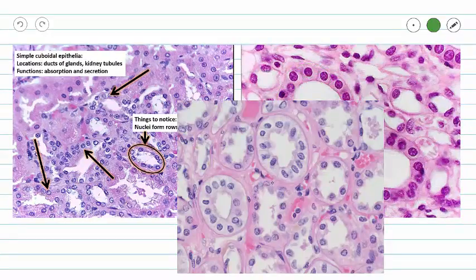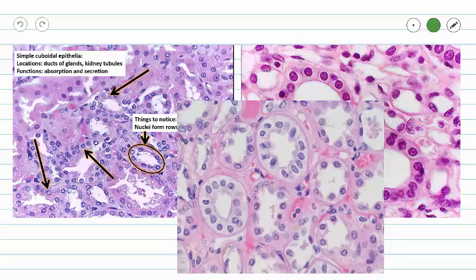And just as one more example, you can see it really depends on the slide that you get what you're going to be looking at. But we still have that round lumen, one layer of cells, and beautiful round nuclei right in the middle of our square shaped cell. So hopefully that helps you distinguish simple cuboidal epithelium. As always if you have any questions about any of this material please do not hesitate to contact your instructor.